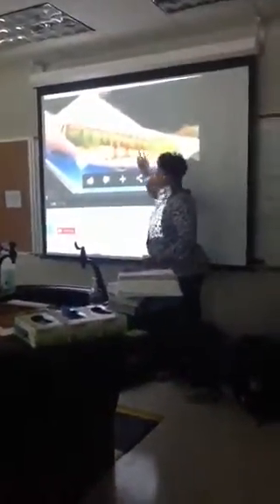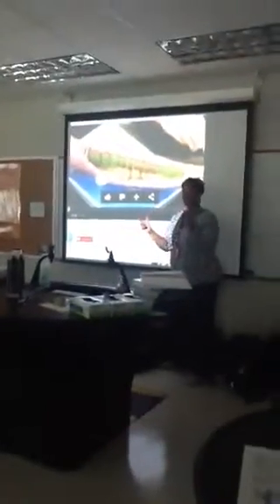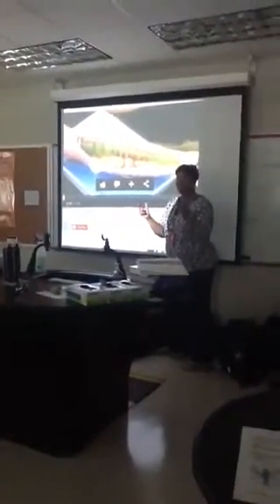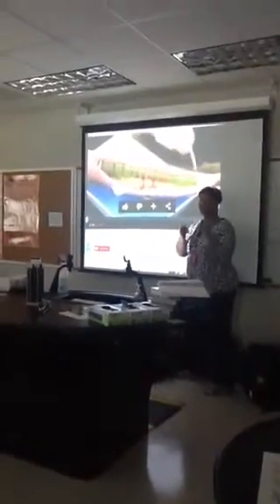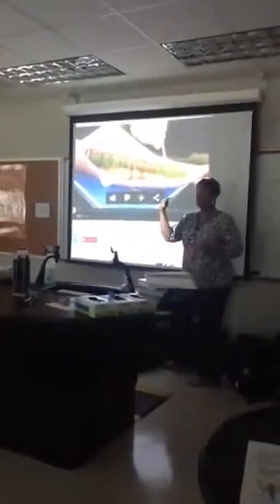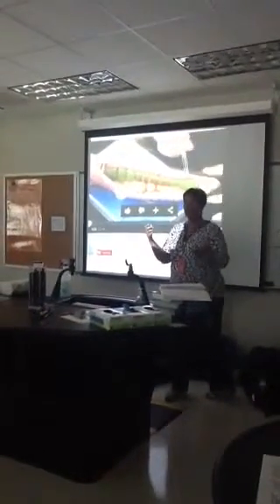Okay? So now as we're doing the actual lab today, those of you who are doing the earthworm may not see this in this particular color, but the earthworm is the same for any class that you're going to dissect. Now, the difference between the earthworm and the crayfish is that today we're doing invertebrates, versus on Tuesday, what will we be doing? Vertebrates.